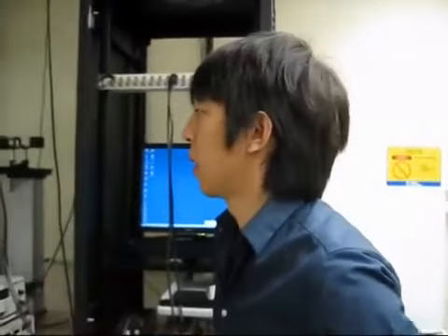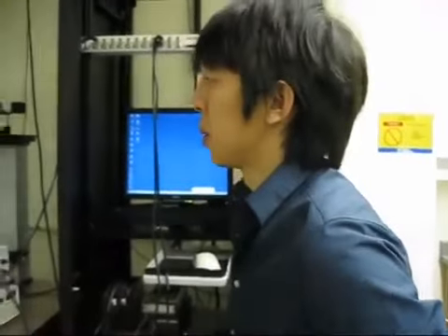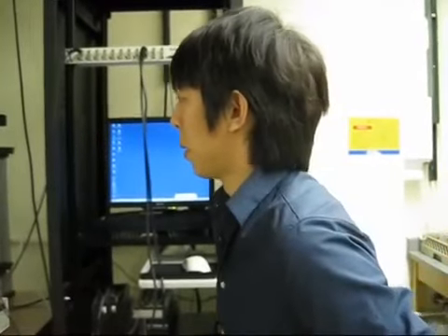For a longer wavelength excitation, using 2 infrared photons as a single photon through this nonlinear effect, we can excite dyes at excitation wavelengths half the wavelength of the femtosecond pulses. So the wavelength we're using the laser at is around 800 nanometers, and so we're exciting dyes at around 400 nanometers, more or less based on fluorescein.